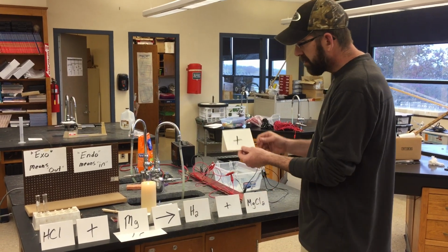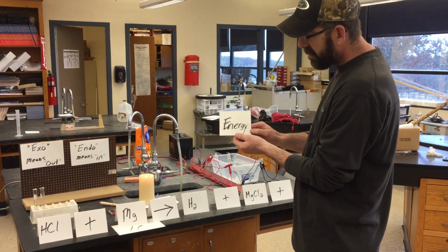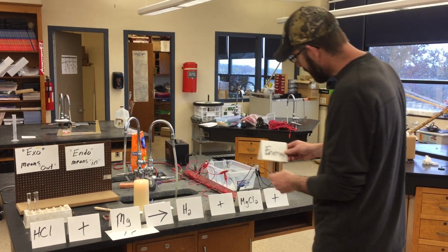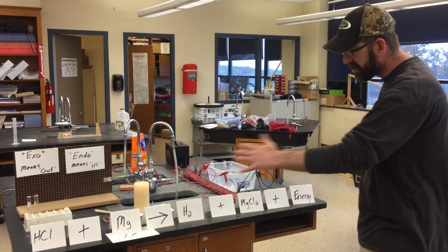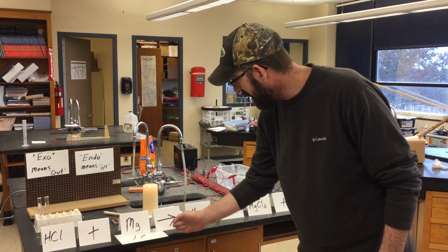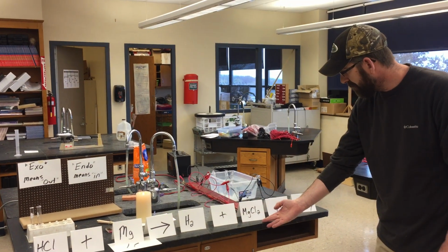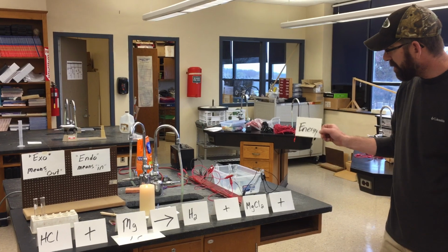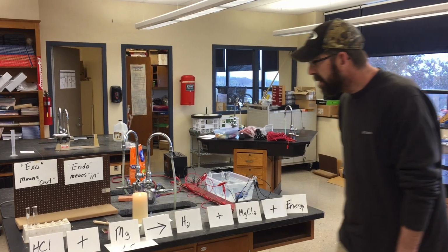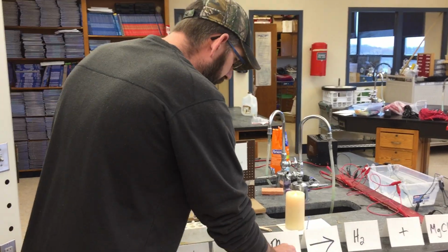And one more thing, in an exothermic reaction, energy is always written or listed on the product side of the reaction. So we're going to put that over here. So if we take a look at this reaction, acid plus the magnesium in the test tube will react, creating burnable H2, and then your MgCl2, and then that heat will be felt inside, through that test tube, when it happens.